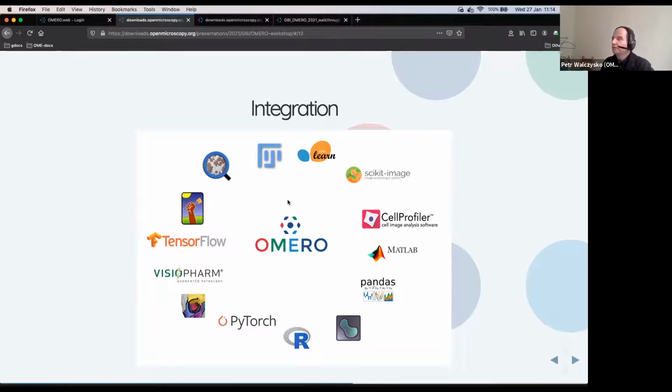And it looks like something different from the previous slide. That is not so. You can hopefully appreciate that each of those softwares is written in a programming language, such as Fiji is written in Java. And because we have that plug, this Java API, we made Fiji to talk to Omero directly. There are some other bridges which we wrote ourselves, or the developers of the softwares in question wrote helpfully themselves. And we will see some examples later.